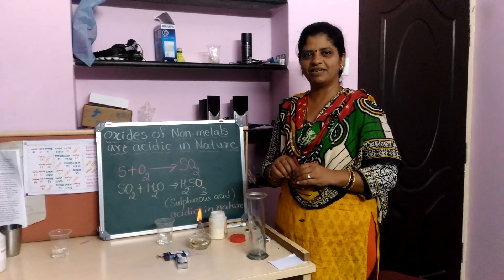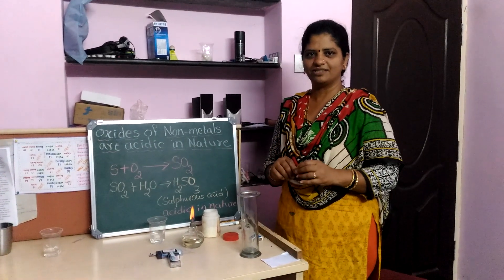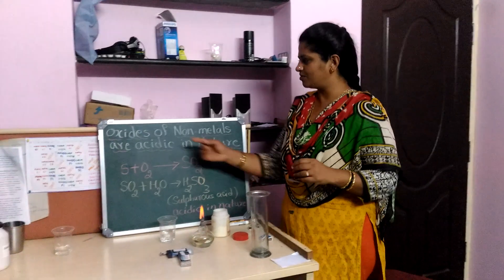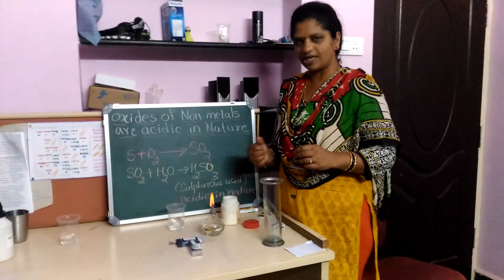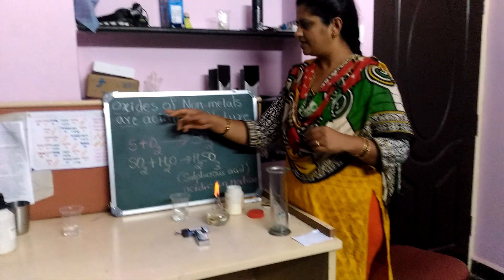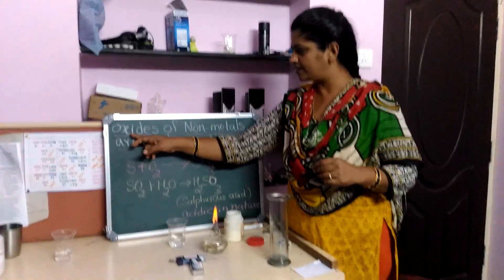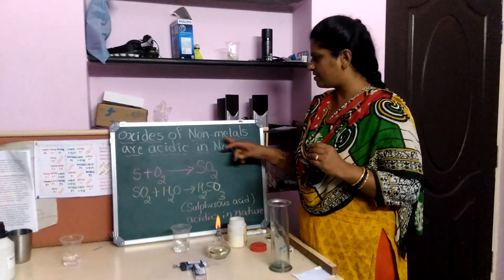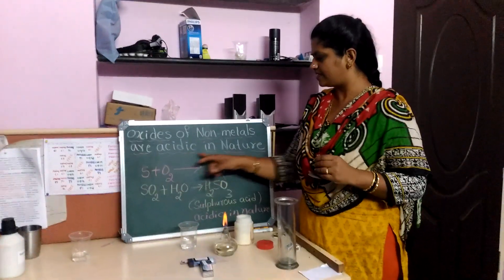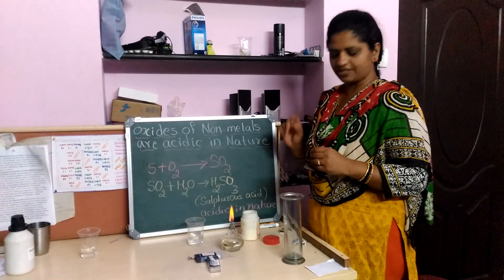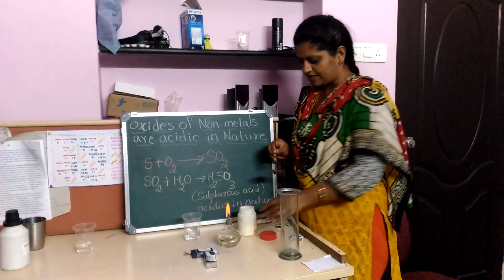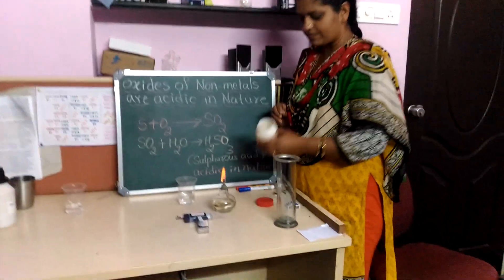Hi, my name is Sujata. Today I am going to show you a small experiment which shows that oxides of non-metals are acidic in nature. Let us take the non-metal sulphur.